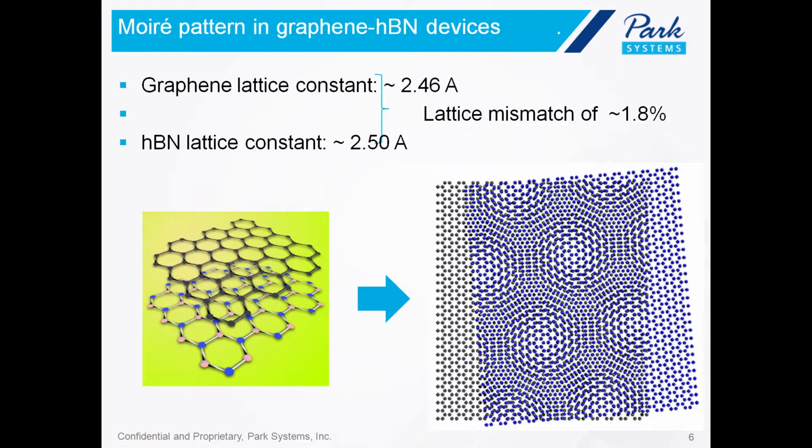They're more vertically aligned with one another, so it appears that there's a space there, and that's the superlattice constant. And then the areas where the graphene and the HBN are not as well vertically aligned with one another, those are the areas that look thicker, that appear thicker in the superlattice pattern. Again, the borders between the hexagonal cells in this honeycomb pattern.